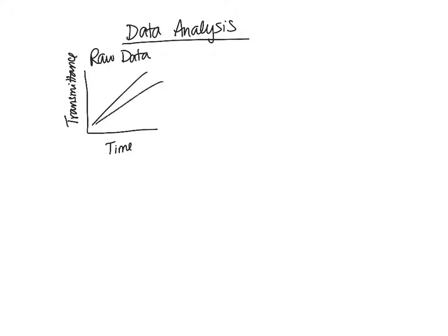And so each line will correspond to a different enzyme concentration. So one might be 0% amylase, one might be 0.25%, 0.5%, etc. And I honestly can't remember whether these lines go up or down, but you'll see multiple lines show up on a graph.